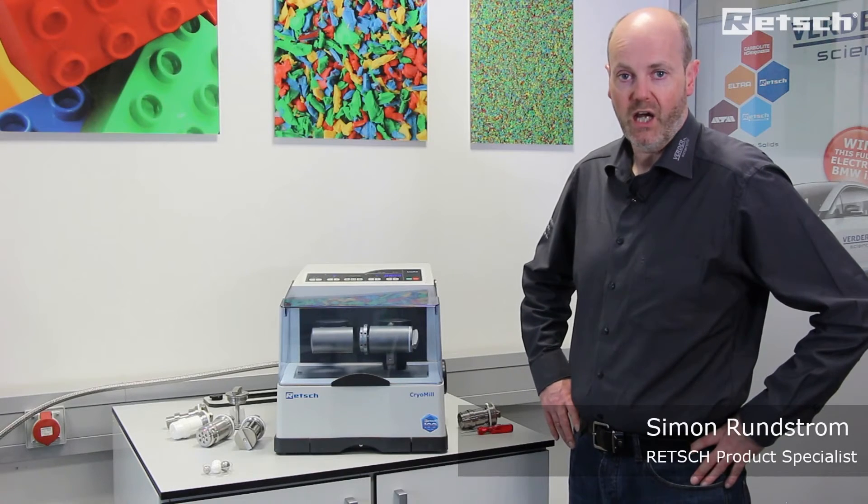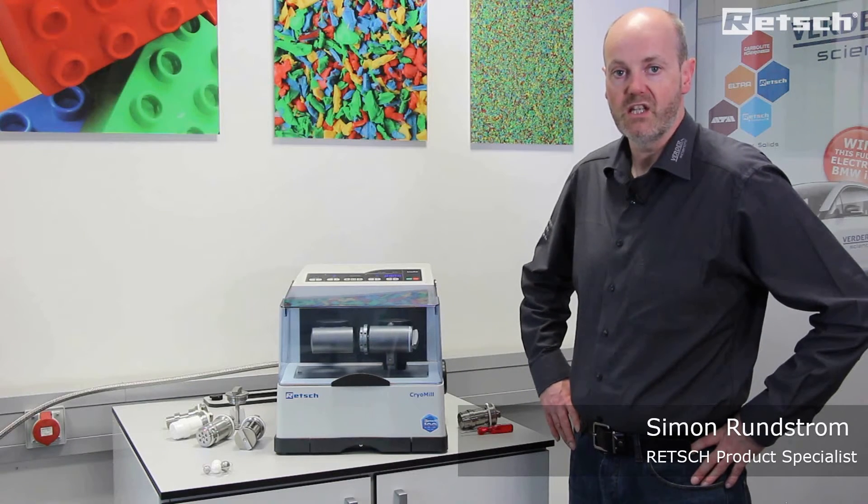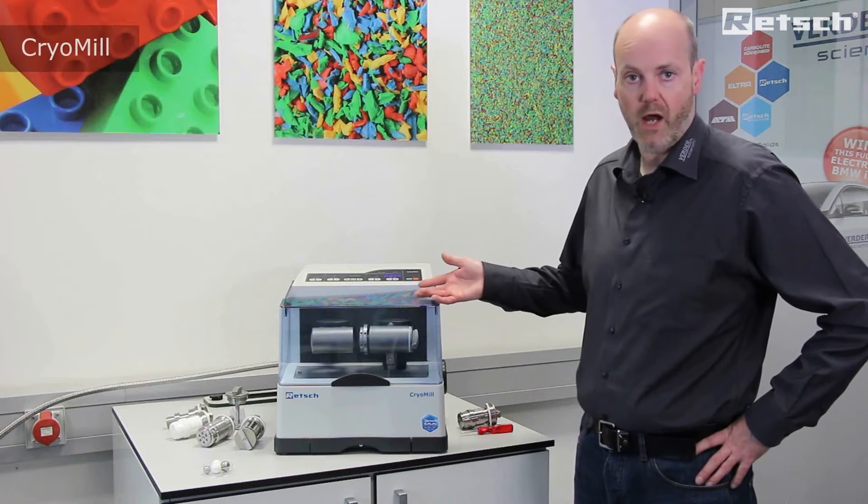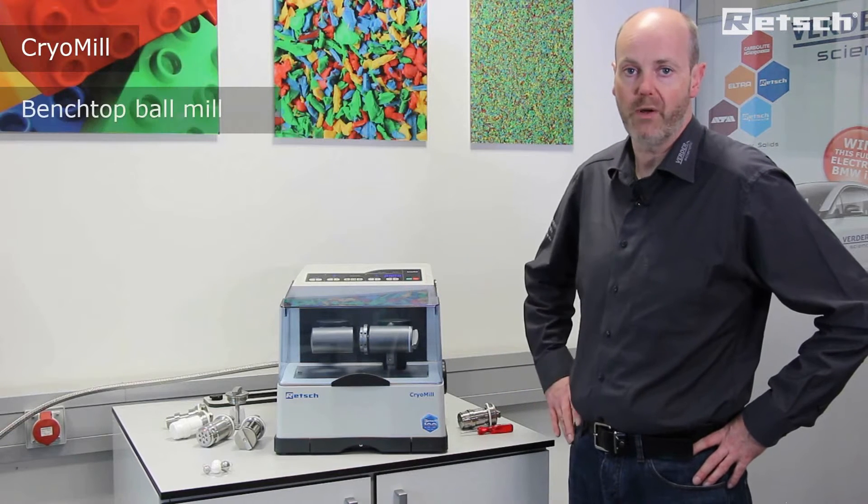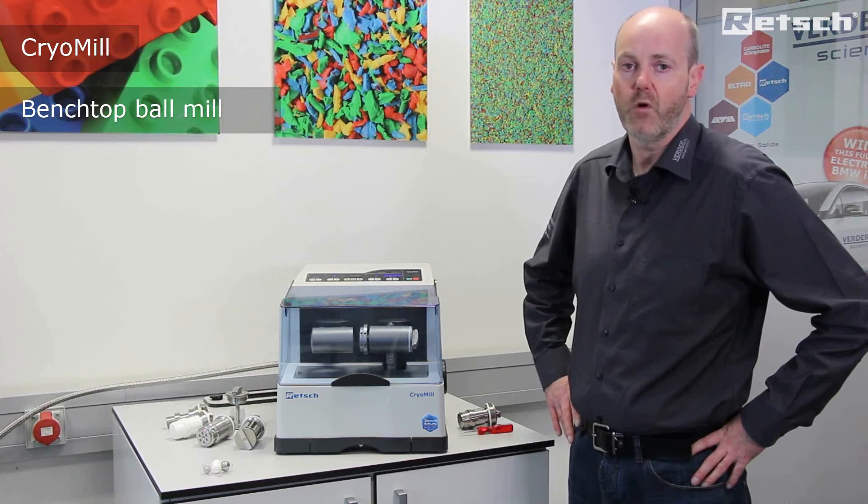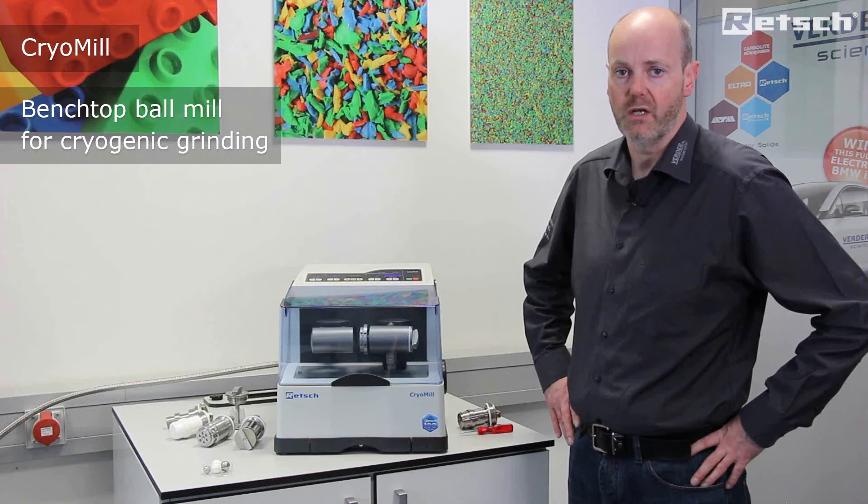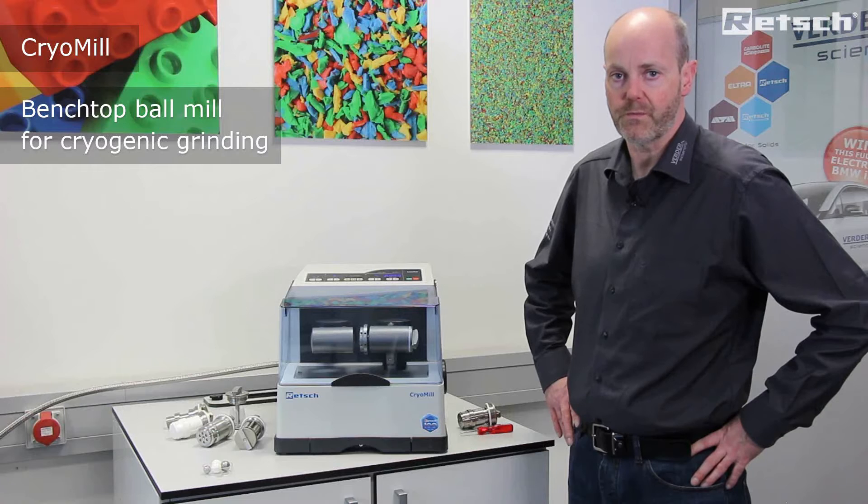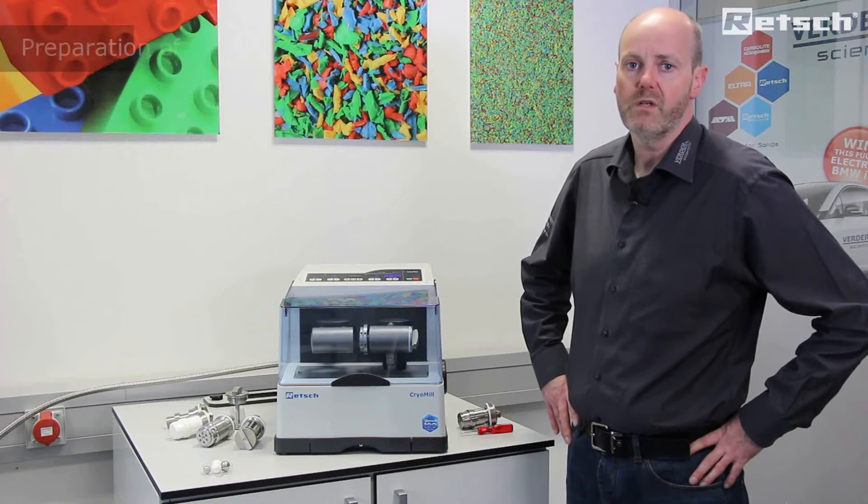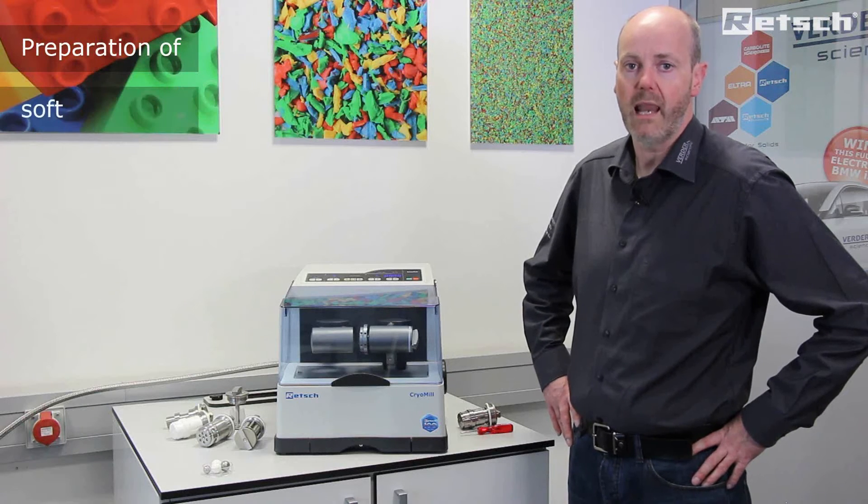Hello, I'd like to take this opportunity to introduce the CryoMill, which is a benchtop instrument that falls within the family of ball mills for the cryogenic preparation of sample materials. It can be used to prepare soft, elastic, fibrous, medium-hard, hard, and brittle materials down to analytical grade fineness.